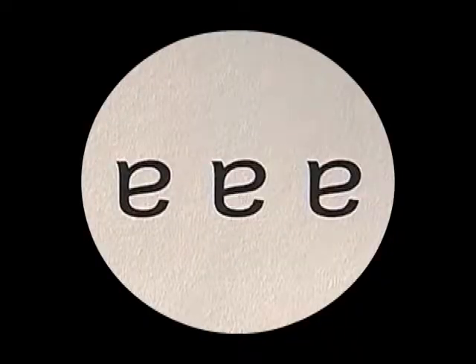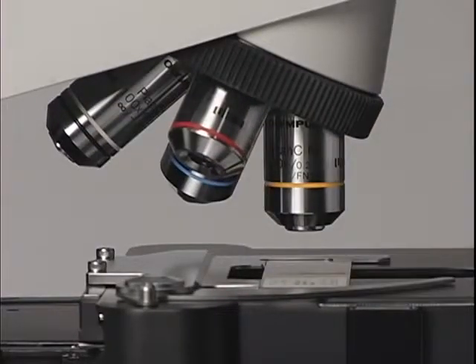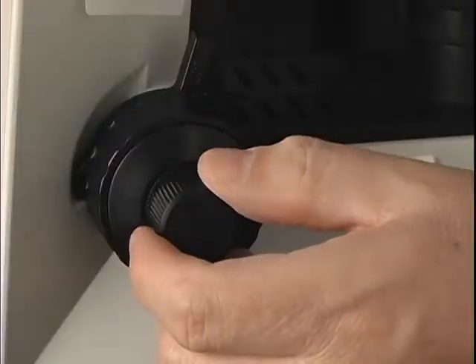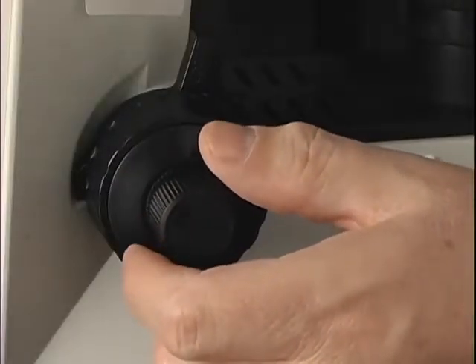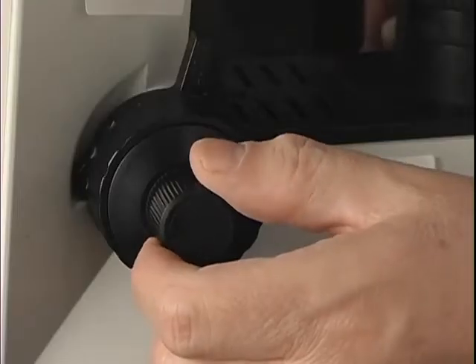Observe the image. Note that the image is upside down or inverted. Move the slide to your left and then up. Note how the image moves in the opposite direction of your movements. It takes some time to get used to these opposite movements. Rotate the nosepiece to the next higher objective. If the objective lenses are parfocal, then you should only need to use the fine adjustment to see the object clearly. At the highest magnification, use only the fine focus adjustment.